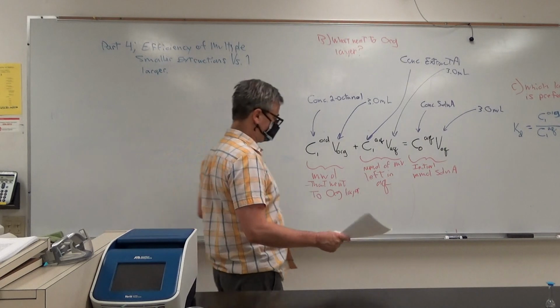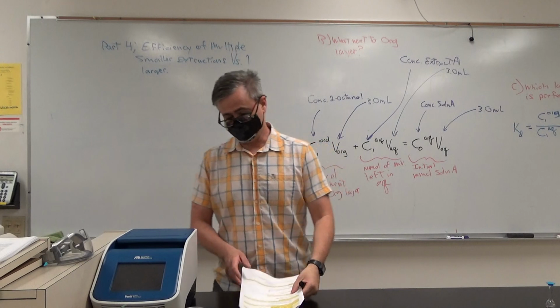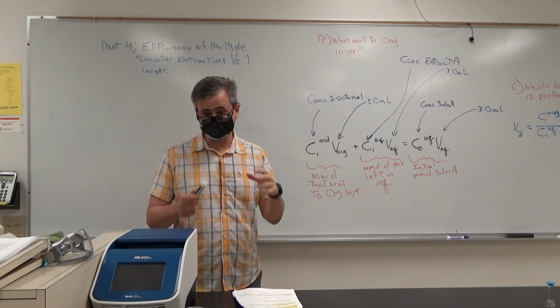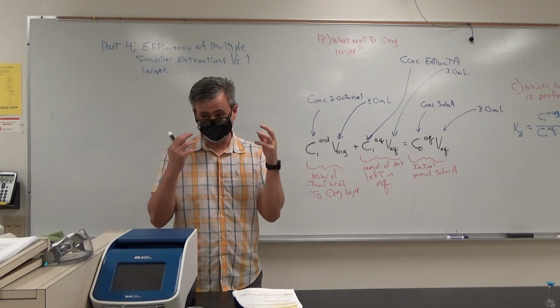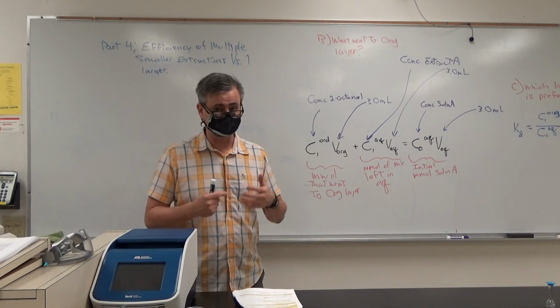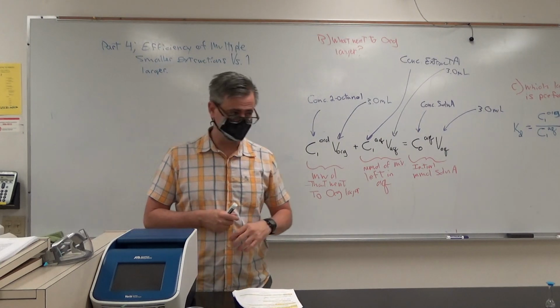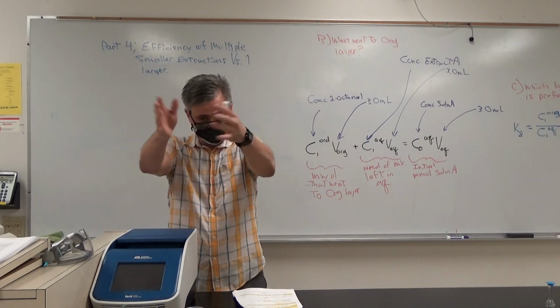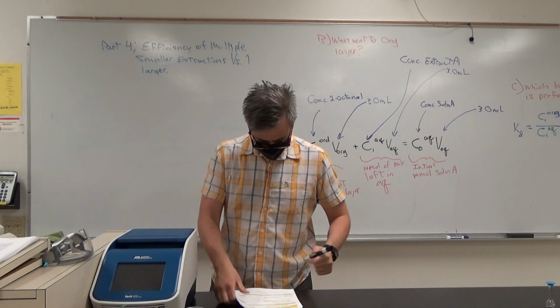It turns out, if you know your partition coefficient, the value that describes which layer a compound prefers, you can figure out how much is going to be left in the aqueous layer. And if you know the volumes you plan to use, you can come up with a theoretical value that should be left in the aqueous layer. A lot of time in these science lab classes, we say, here's the theoretical value, now go do the experimental value and compare the two. This is one of those situations.